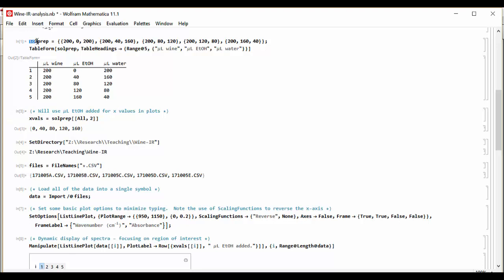I created the table of volumes using this symbol up here, so that means that the actual x values that I'm going to be plotting against, which is the microliters of ethanol, can be found from this symbol.